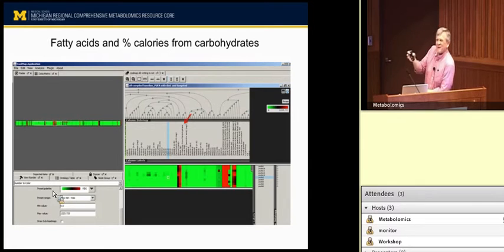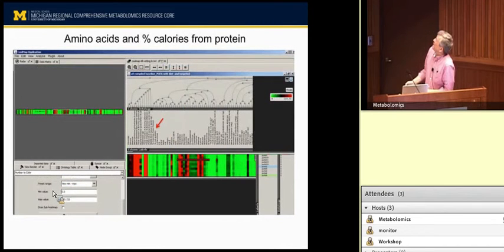Remember, I said that when you feed the high carbohydrate diet, you see an increase in saturated and monounsaturated fatty acids. Independently, we got the amount eaten by these individuals, put it together with the metabolomics data, let the computer find the relationships, and they actually cluster together. That's really satisfying because it says that maybe this is actually going to work.